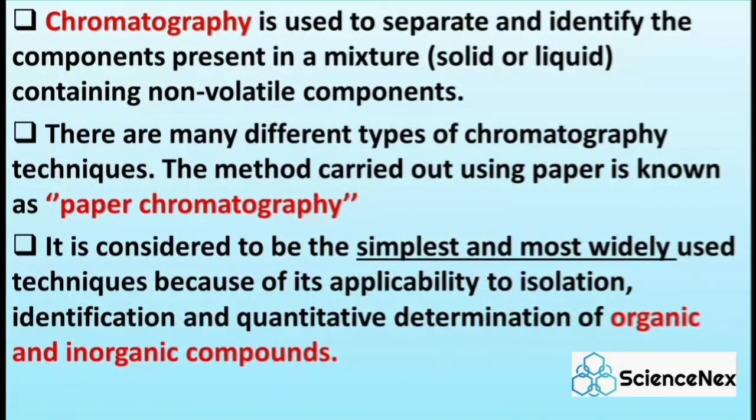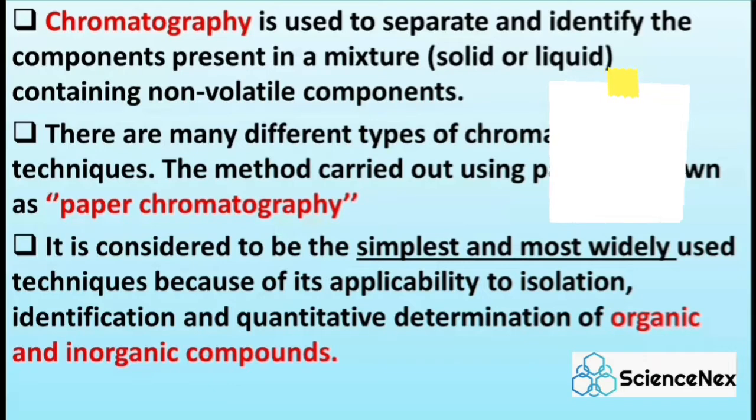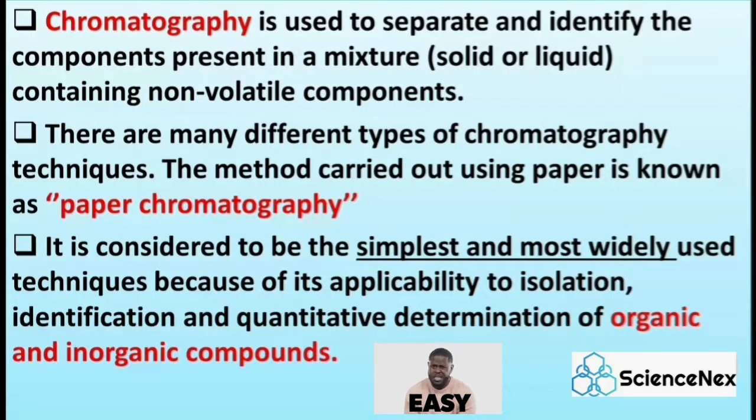Chromatography is used to separate and identify the components present in a mixture containing non-volatile components. There are many different types of chromatography techniques. The method carried out using paper is known as paper chromatography. It is considered to be the simplest and most widely used technique because of its applicability to isolation, identification, and quantitative determination of organic and inorganic compounds.